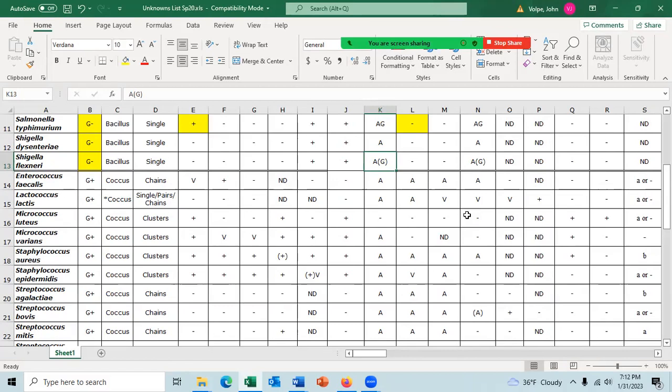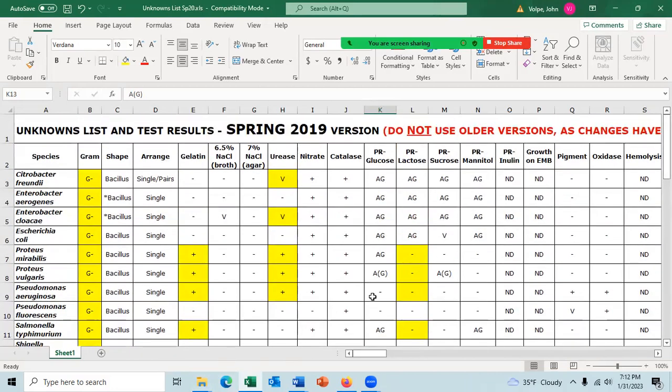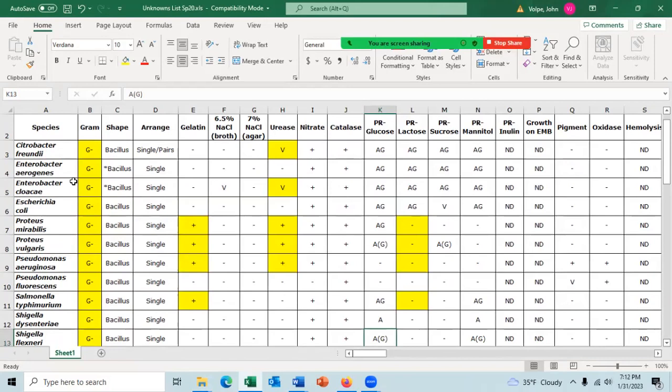And it kind of depends on when you're looking at the culture, as well as which media you're growing them in. Let me see if I can remember. I don't remember for Lactococcus lactis, but I do remember for Enterobacter aerogenes and Enterobacter cloacae.